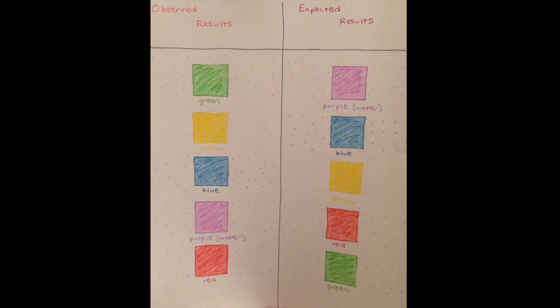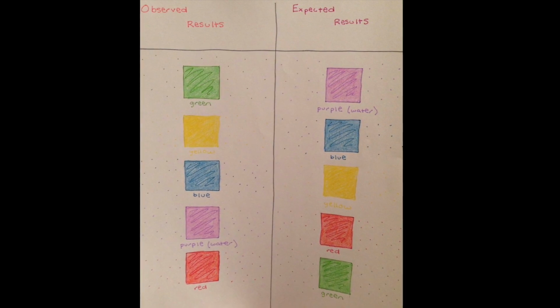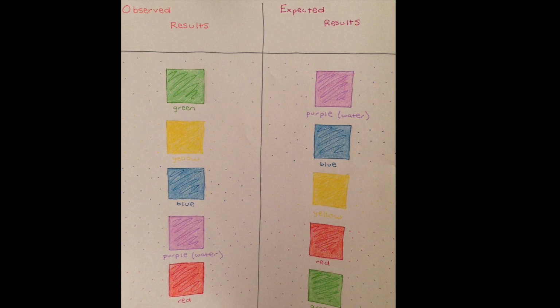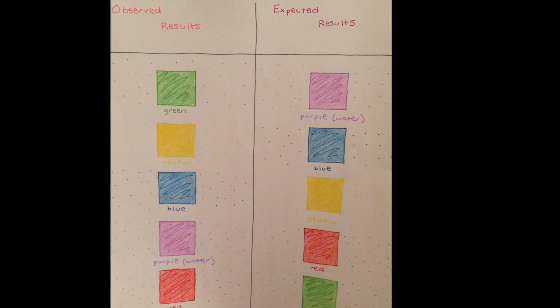As a whole, our group was not able to successfully match all the glucose solutions. Instead of having a variety of solutions, some hypotonic, hypertonic, and isotonic, our results concluded that all the solutions began as hypertonic and resulted in hypotonic cells.